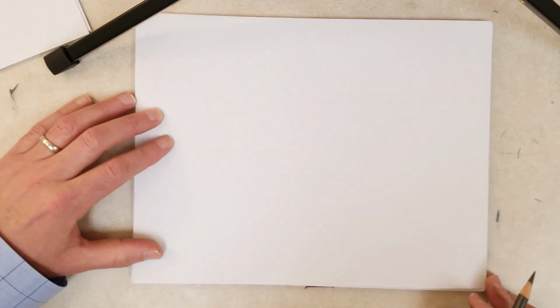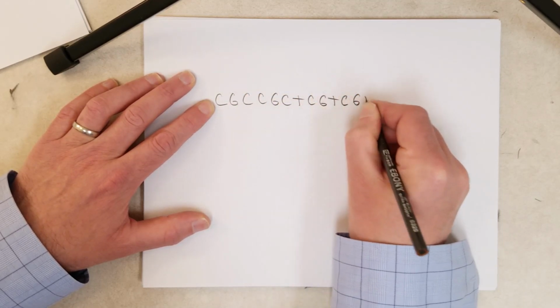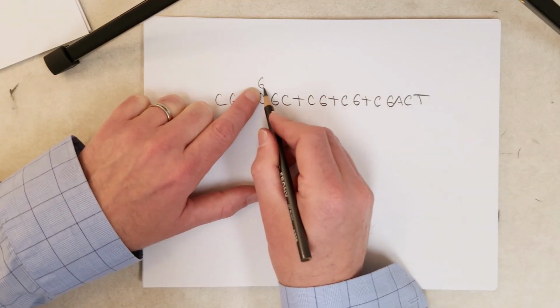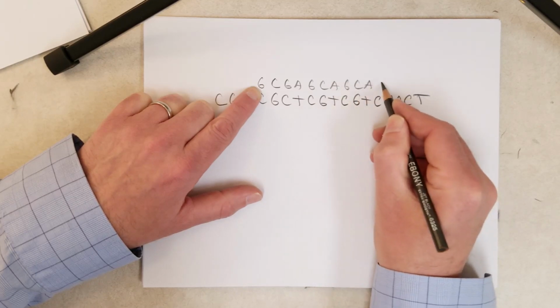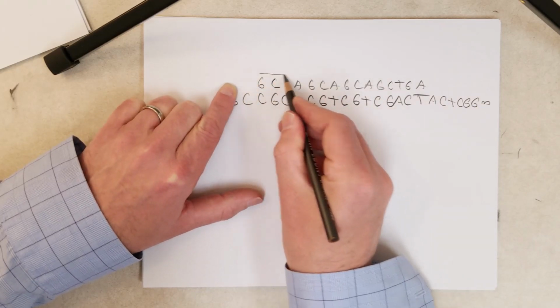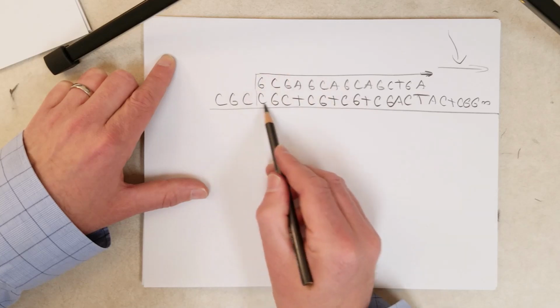Let me expand upon that a little bit so I can show you how we could get mispriming if we choose too low of a temperature. So here is a sequence of DNA. Now here is our primer. Let's say we want our forward primer to bind starting here. Now this is going to be perfectly complementary. And this is how we want our primer to bind to this DNA molecule here. And okay, so we're going to copy this piece in here, and it's going that way. And this is a perfect interaction between a primer and a template.